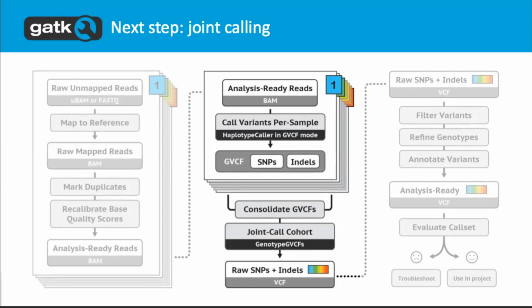The GQ, so the genotype quality, is the one that will usually give you a really good sense. Most sites will end up with a GQ in the 90s, somewhere between 90 and 99. Technically, you can have a higher score, but we cap it at 99 because anything above 99, we're super sure, and there's no point in knowing that it's 200. 299 means the same thing. Super sure of this genotype.